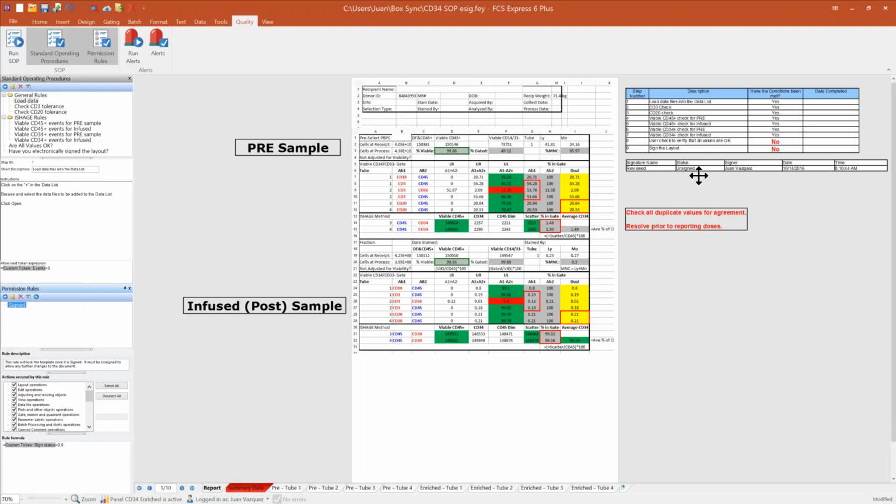I have to unsign my document to be able to reanalyze my data, because theoretically, if you sign something, that should be it. Well, we can create a rule that allows this document to be locked until it is unsigned. And if you do have 21 CFR compliance, you probably also have our audit trail capability. So this is all information that's captured within the audit trail, so you can see who signed, who unsigned, and whatever changes were made after the unsigning. Okay. All right.